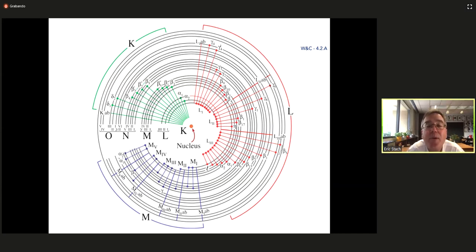A soil sample in polished resin can be suitable for tomography analysis, for mineral particles, for example. Yeah. So Renee, great question. One of the things that's a constraint, so I mean, TEM is wonderful, right? It does everything, like I just told you, as long as the sample's thin. And so you're saying if you take a soil sample and you have it in a resin, can you make a sample that's thin enough for tomography and do tomography with it? The answer is yes, but depending on the size of the moiety, the size of the thing that you're looking at, you may have to look at a subset of it, right?